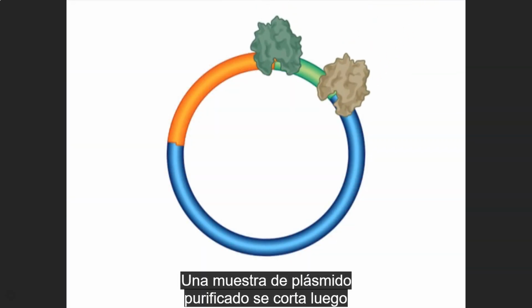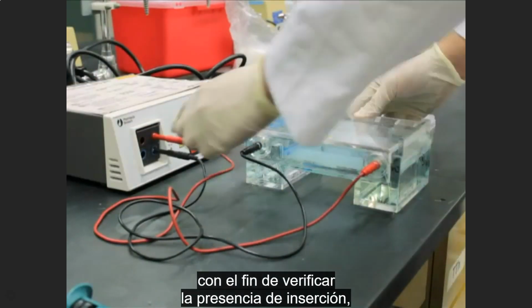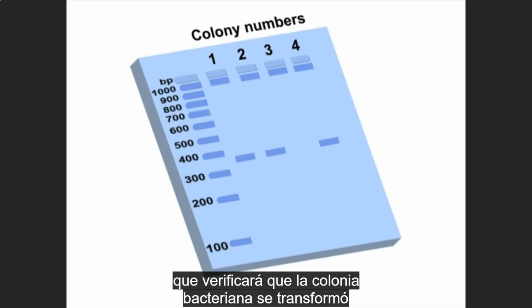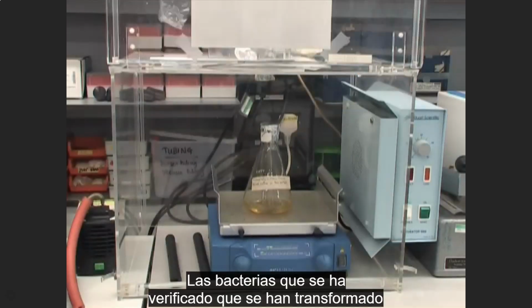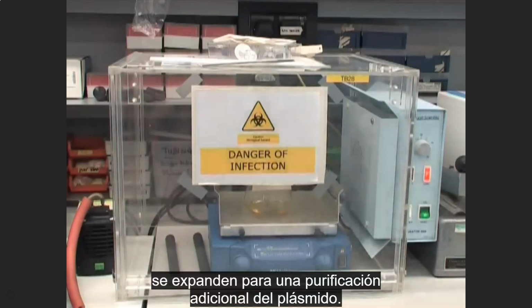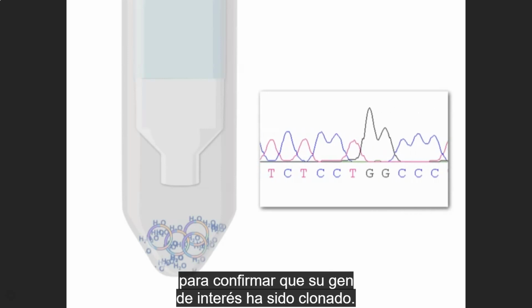A sample of purified plasmid is then cut with restriction enzymes. The digest is then loaded and run on a gel in order to check for the presence of insert, which will verify that the bacterial colony was transformed with the plasmid containing an insert and not self-ligated plasmid. Bacteria verified to have been transformed with an insert containing plasmid are expanded for further plasmid purification. Sequencing is used as a final verification step to confirm that your gene of interest has been cloned.